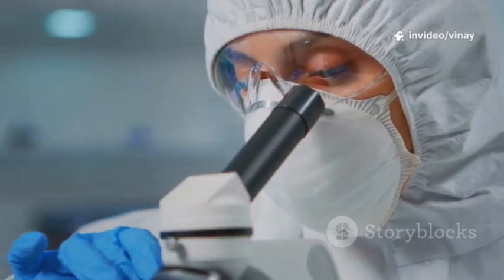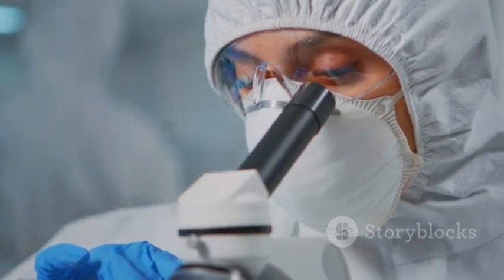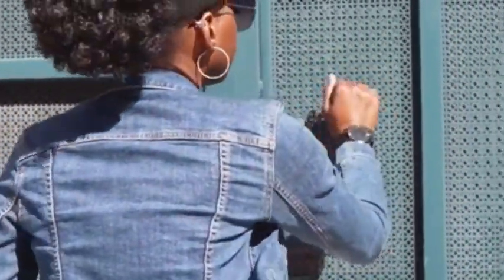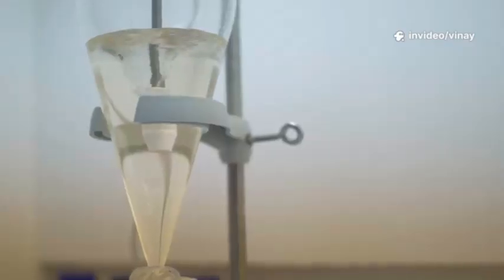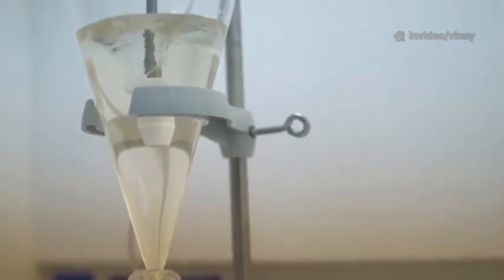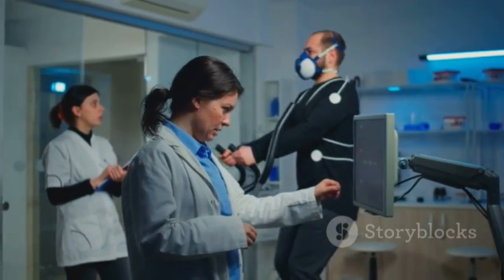So, what does integrity mean here? It means the filter is whole, strong, and doesn't have any hidden damage. Think of it like checking a window screen for holes before summer. If there's a tiny rip, a mosquito can get in. In medicine, if a filter has a tiny tear or a pore that's too big, a dangerous bacterium could get through. That would be very, very bad for the person taking the medicine.